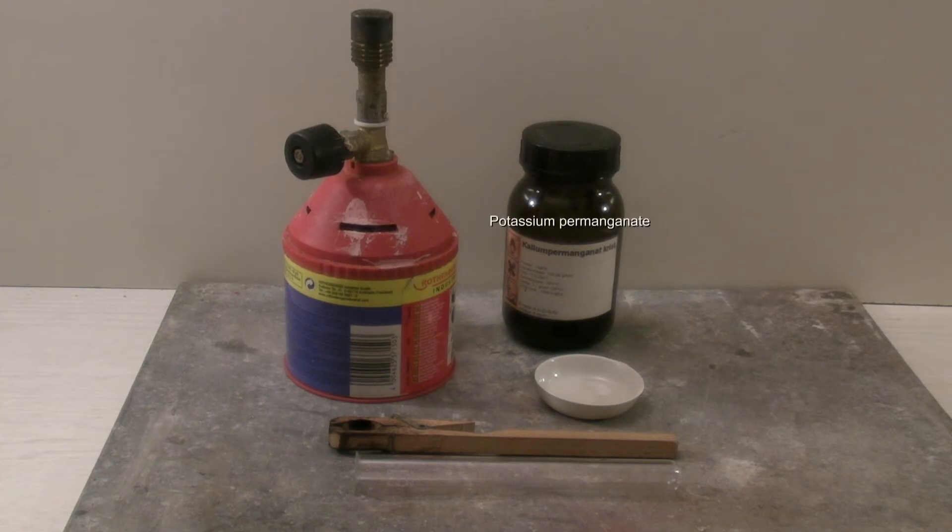For the test, the following is needed: a Bunsen burner, a test tube, a test tube holder, and a porcelain dish or a small beaker. The use of potassium permanganate is optional.